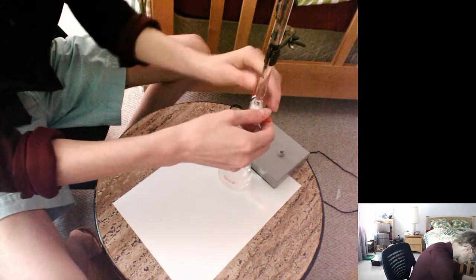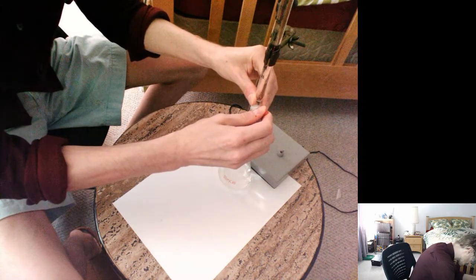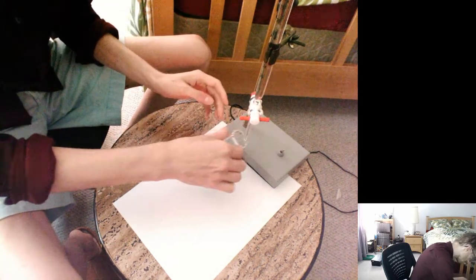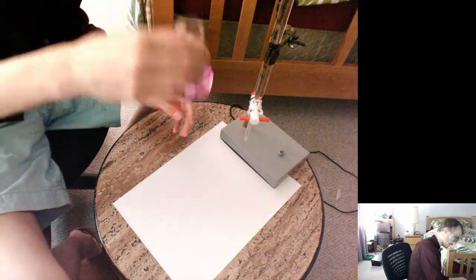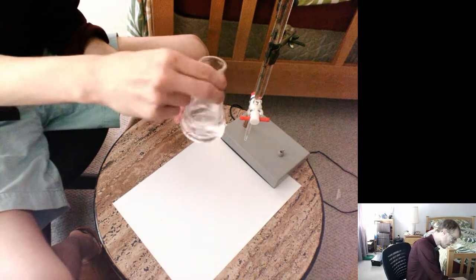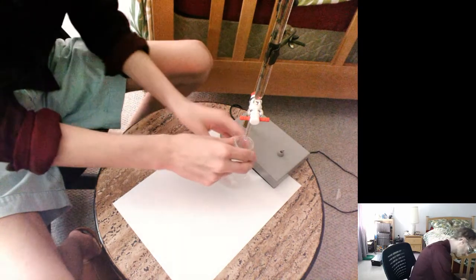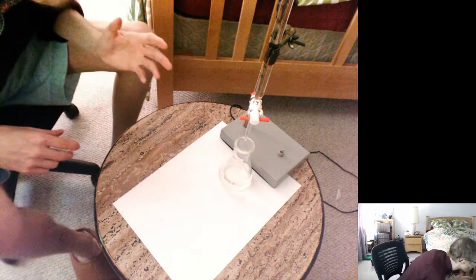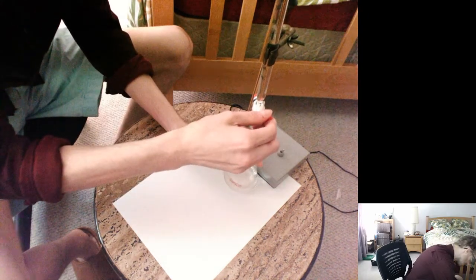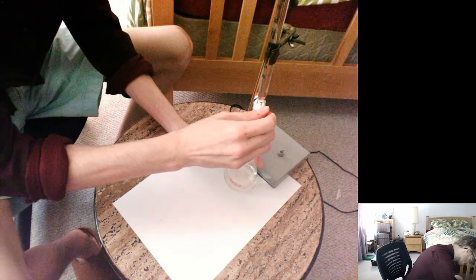Oh, so I've got to be extra, extra careful. And I want to make it so that it will stay pink for a few seconds. So it was 1 drop, 2 drops. And you might have seen that. It got really dark pink, but then it turned away once I stirred it. So far we've added 14.9 milliliters.